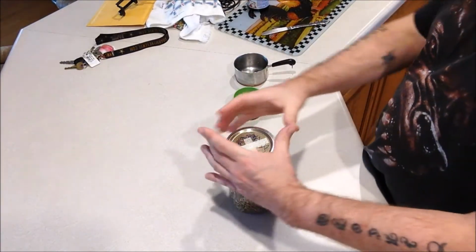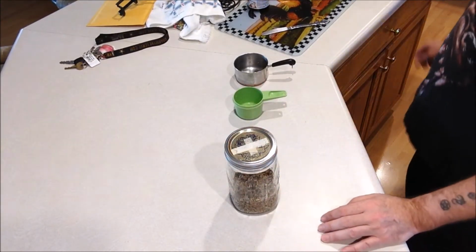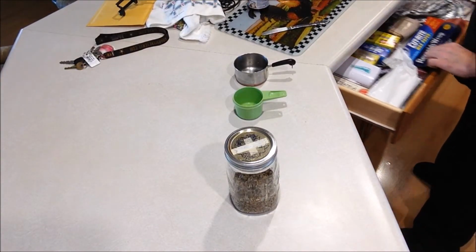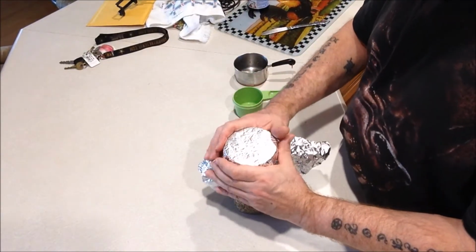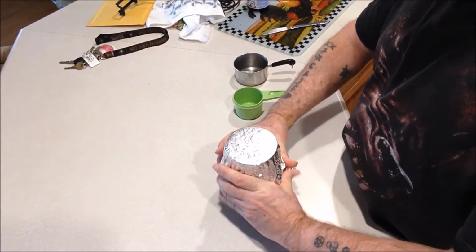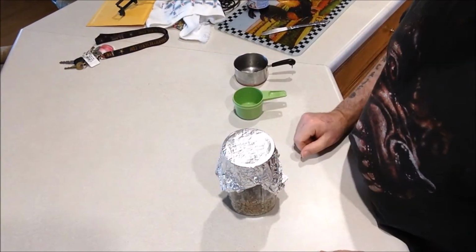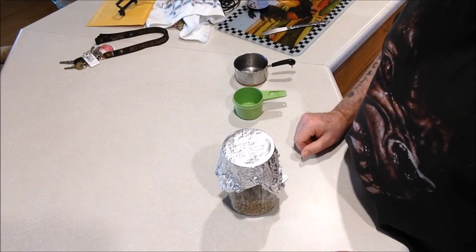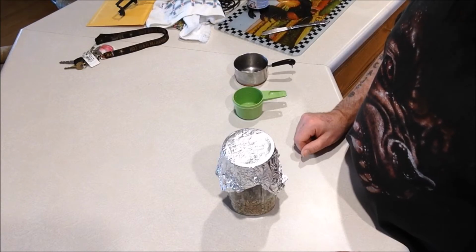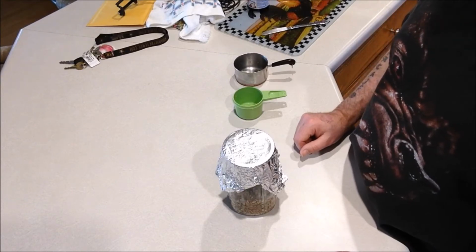And then I like to put foil over it, that way no water gets inside your jar that's not supposed to be there. I just get a piece of foil. Of course, it doesn't have to be this big. This was just handy. And then you stick that in your pressure cooker, and you pressure cook at 15 psi for 2 hours. And then as soon as the jar that's done in the PC right now, I'll take that out and show you how they turn out. I'll be right back.